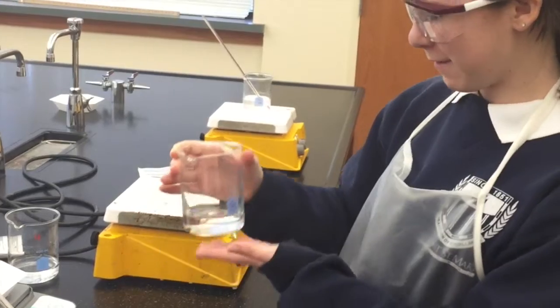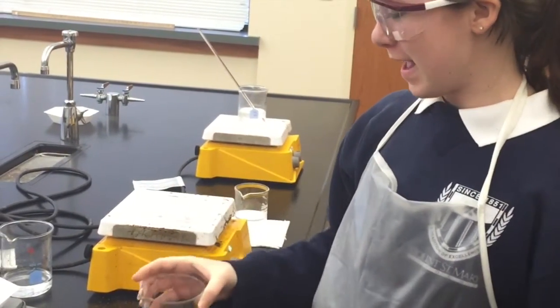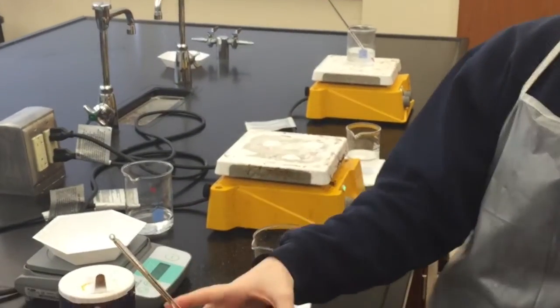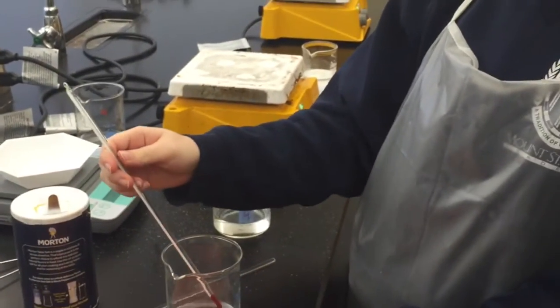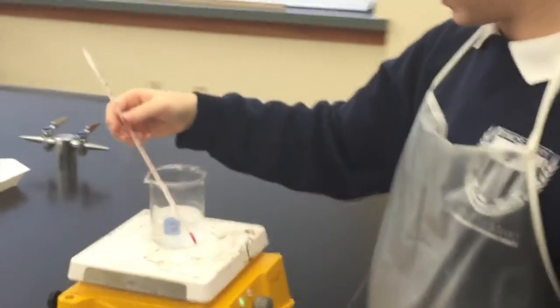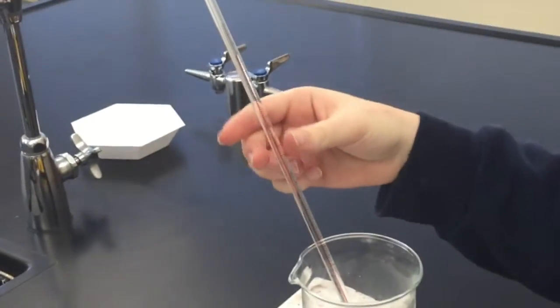Okay, so here we have 100 milliliters of water and 20 grams of salt on the scale, and we're going to mix it together, and we have that right here, and then we measure the initial temperature of the water, and then once we have that temperature, we put it on the hot plate over here, and we measure the temperature when it first starts boiling, and then measure it when it hasn't changed anymore.